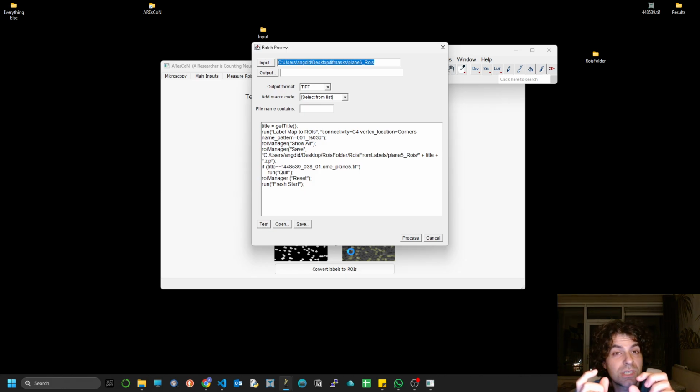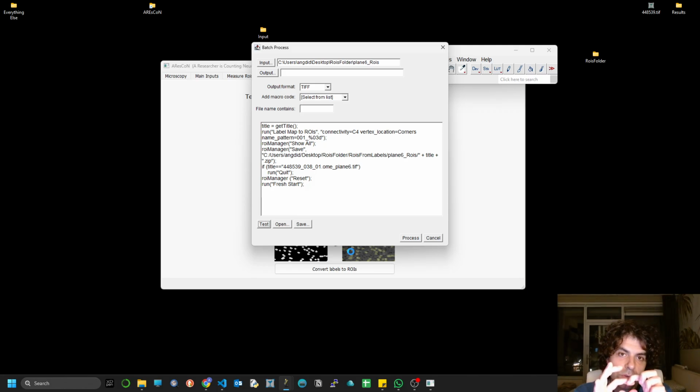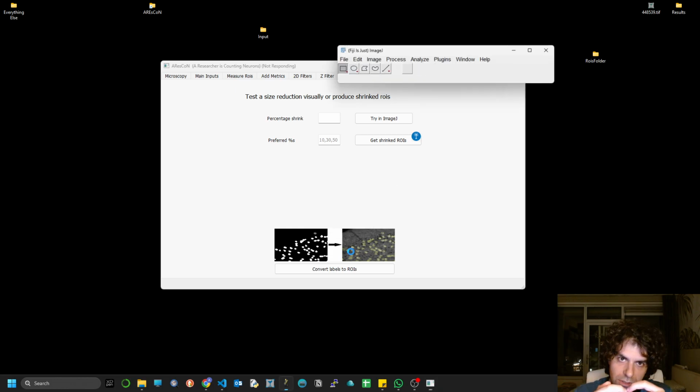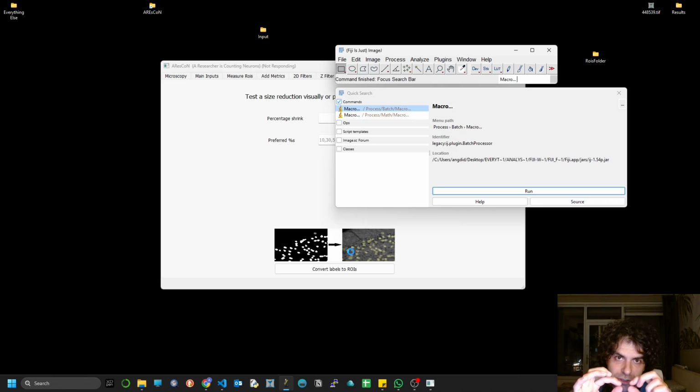Imagine you have two adjacent neurons, nuclei, whatever. Cellpose, at least the version of Cellpose that I'm using, is never overlapping two observations. It can discriminate between two different objects, but it will draw contours that are not really overlapping. However, when you do it in Python, there's always also a gap left in between these contours.